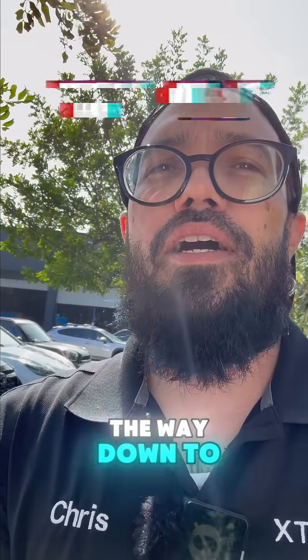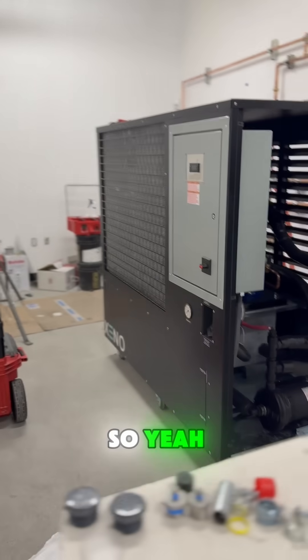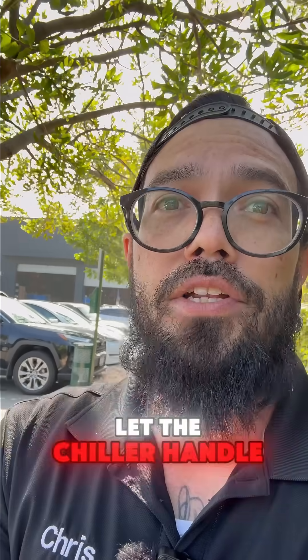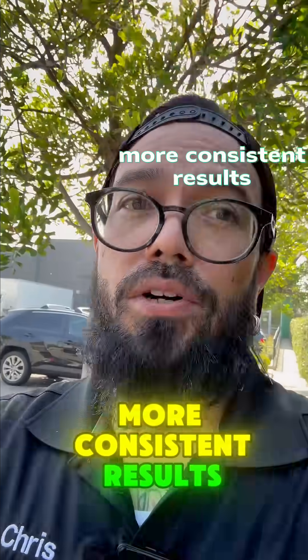The XUT series dives all the way down to negative 80 for specialty isolation and terp work. So if you keep your process around negative 50 Celsius, keep the column flooded, and let the chiller handle the workload, you'll get a cleaner yield and more consistent results.